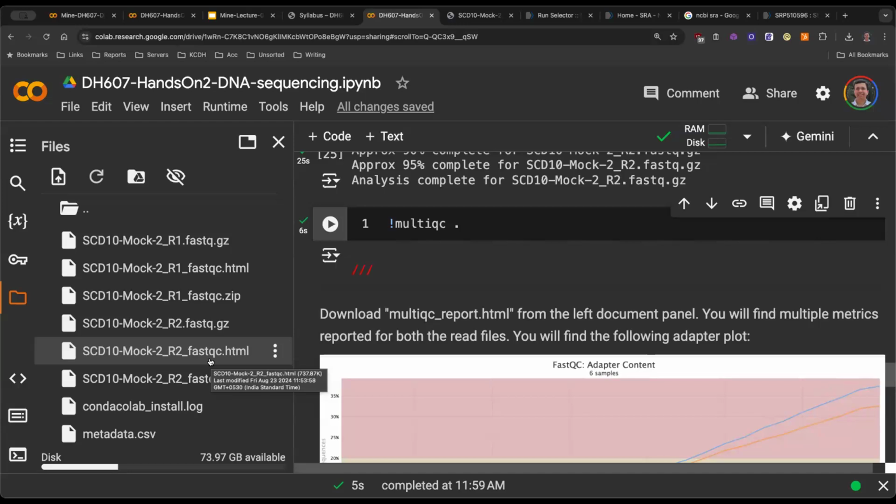So this is your flow cell, and there is a cluster of sequences sitting here. That's what you say, right? So this is cluster 1, this is cluster 2, and so on. The camera is actually in sync. So this base pair extension that you see here will be associated with some other base pair. Obviously, it will not be the same, but this is actually happening at the cluster level.